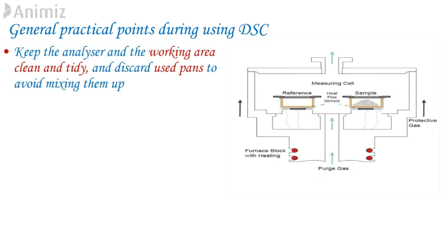The DSC furnace should be kept clean. Refer to the manufacturer's instructions for the most appropriate cleaning method. Avoid abrasives and be aware of the dangers of using flammable solvents. Take note of specific instructions for any particular type of furnace.